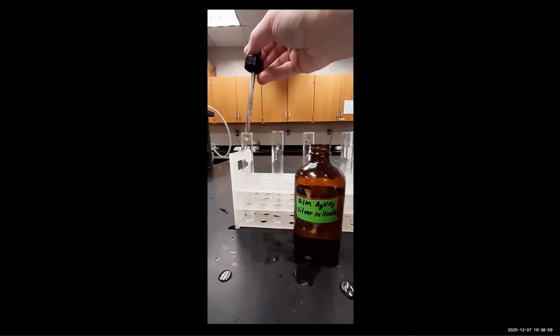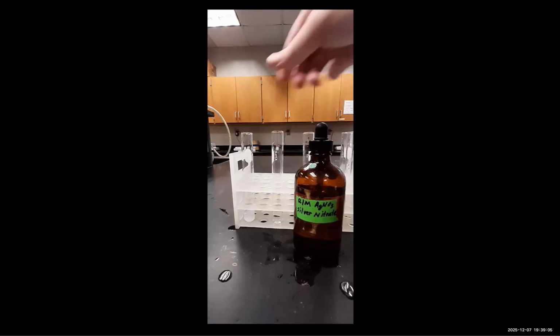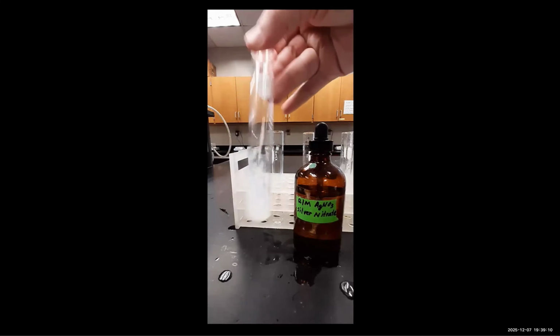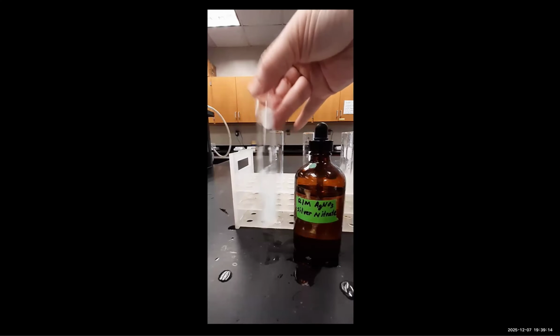So we're going to write down our observations for the silver nitrate test. This is what we're testing right now with the silver nitrate test. As you can see, we have a positive test result for the silver nitrate test.